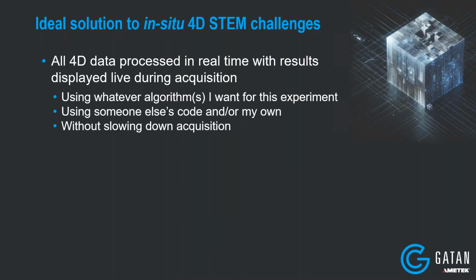I think first of all, we would want to be able to process all the 4D data in real time with results being displayed live during acquisition. And I would want to not just have one or two algorithms that I can use, but be able to use whatever algorithms I want for my particular experiment, right?